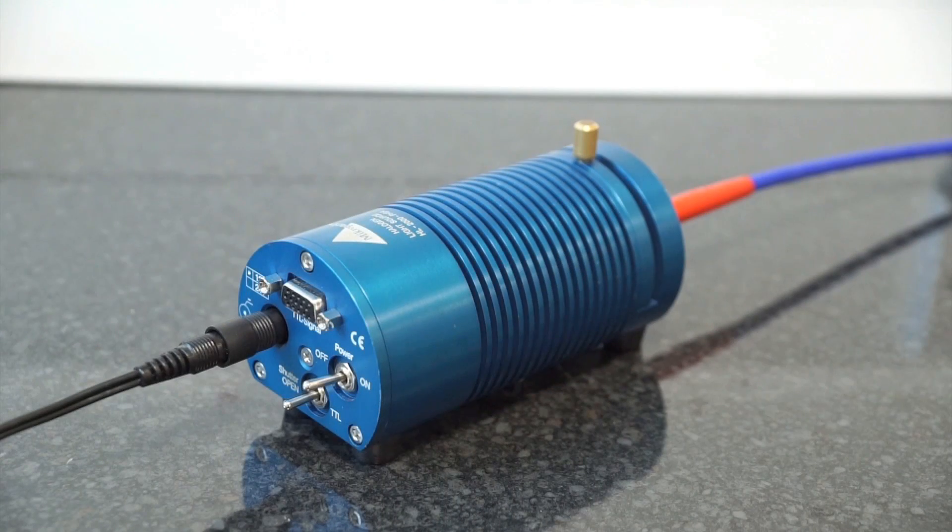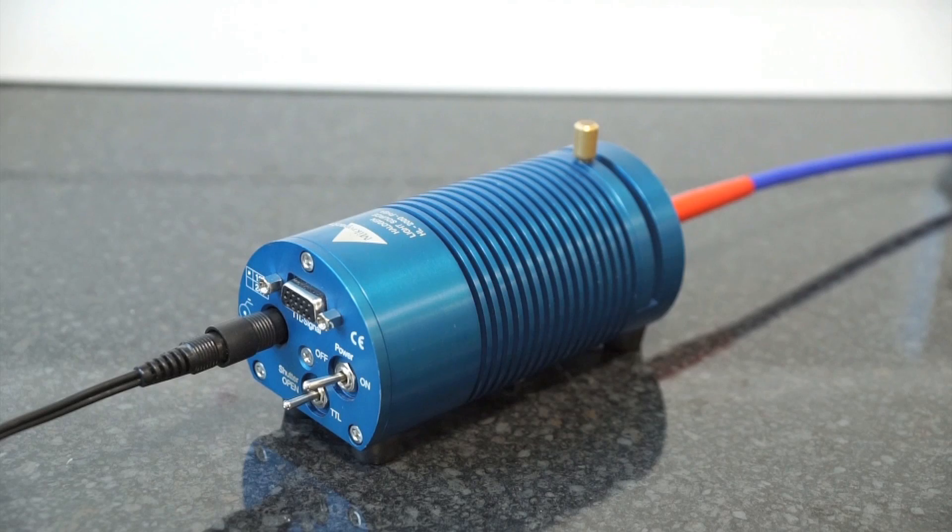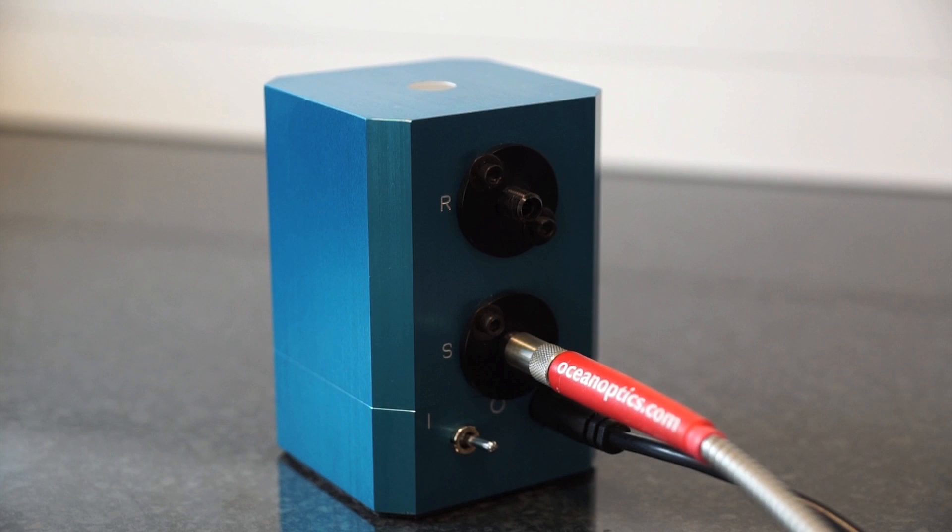Alternatively, you can use an external light source through a fiber which can be attached through the S port to illuminate at 8 degrees.